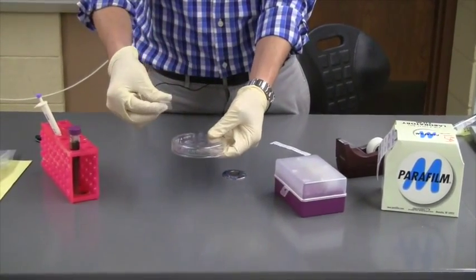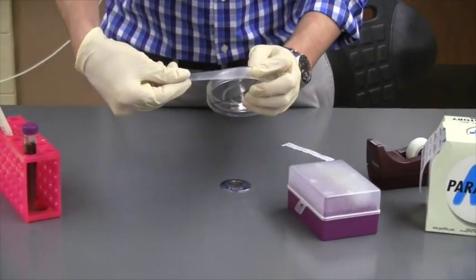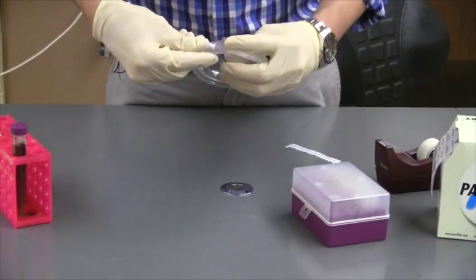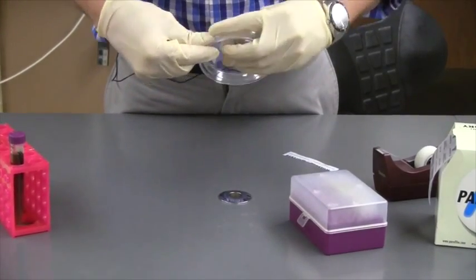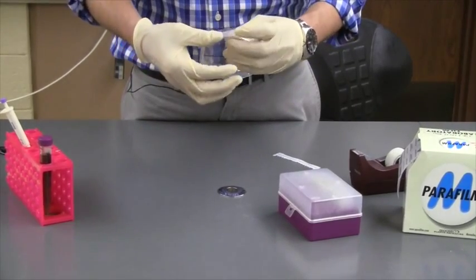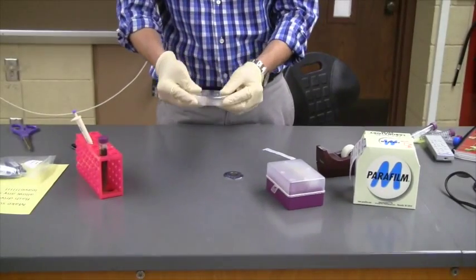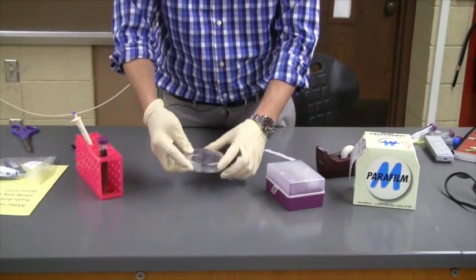It will stretch out kind of like Glad Press and Seal. Once your bacteria solution has soaked into the plate, you can take the parafilm and stretch it all the way around the sides. This will create—oh, I stretched a little too far—a nice seal. Fortunately, it's kind of sticky. A nice seal all the way around that you can use to keep the lid of your plate to the bottom of the plate.